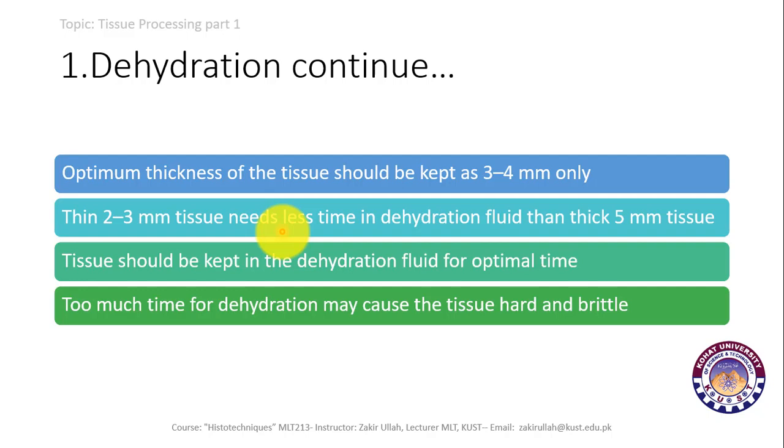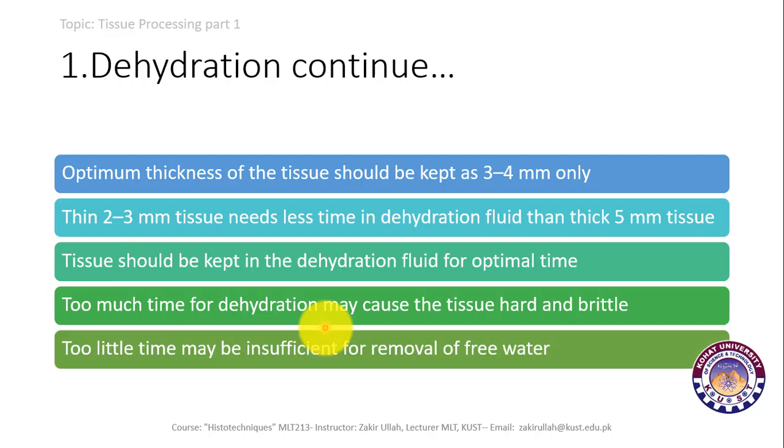If we give too much time for the dehydration, this may cause the tissue to become hard and brittle, so the tissue may be damaged. And if we give too little time for the dehydration, that time is insufficient for the removal of free water molecules.